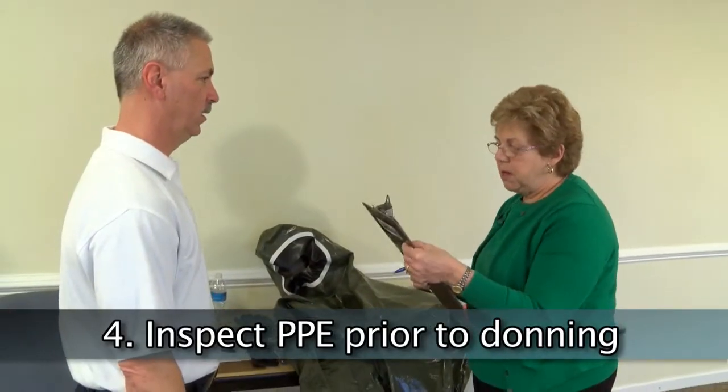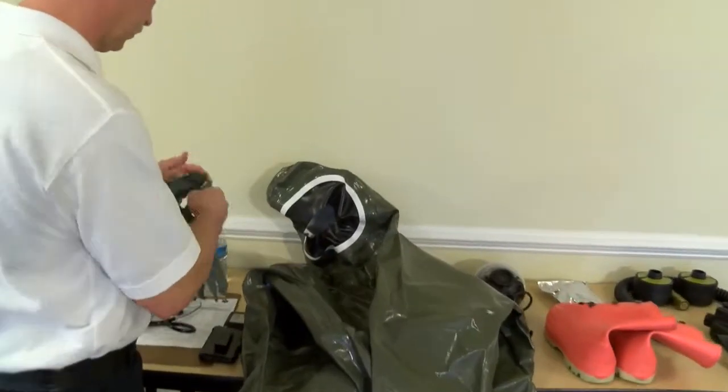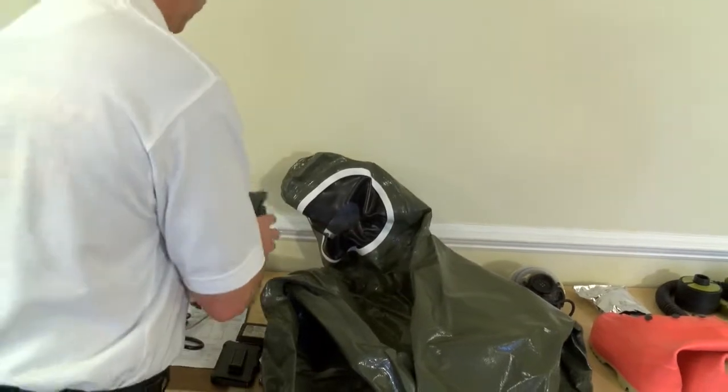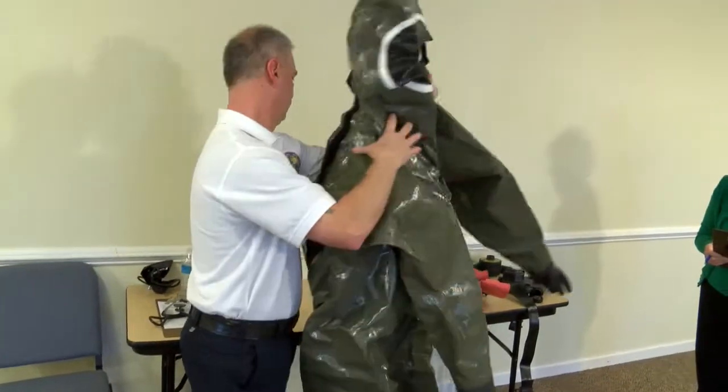Inspect PPE prior to donning. Inspect each item of personal protective equipment. Ensure nitrile butyl gloves do not have holes or tears. When inspecting the suit, examine all seam integrity.